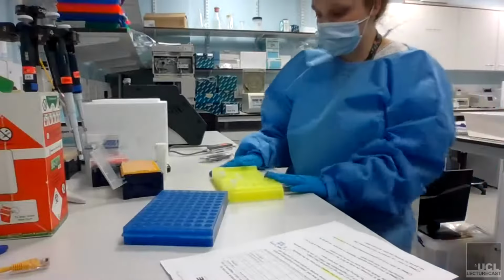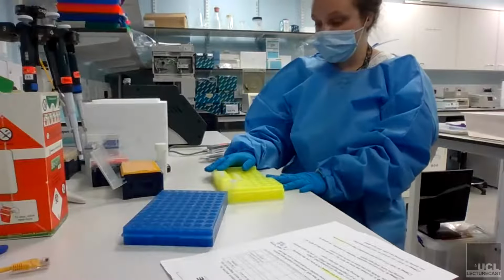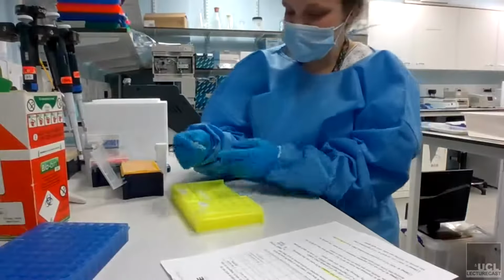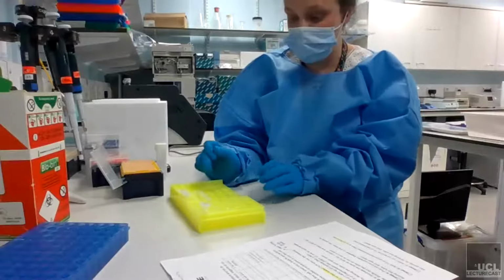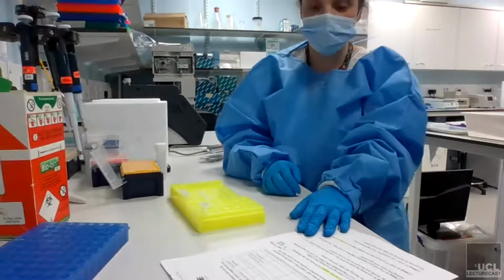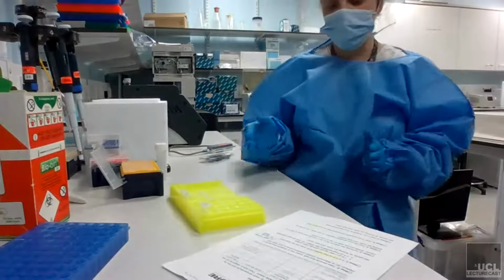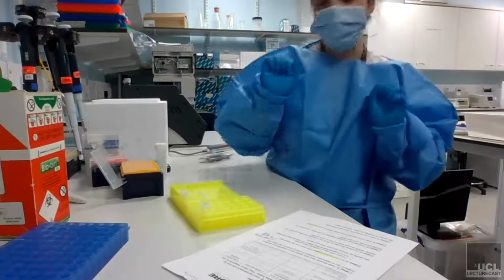So to begin with, we have to start and prepare our DNA. You will need to have extracted your DNA. So these are my extracted DNA samples. What you'll need to do before you start sequencing is identify the concentration and also the size of the DNA. With this protocol, what we're doing is the Rapid Barcoding kit, RBK004. This is a quick protocol, but it requires a good amount of DNA, good sized DNA, and also clean DNA.